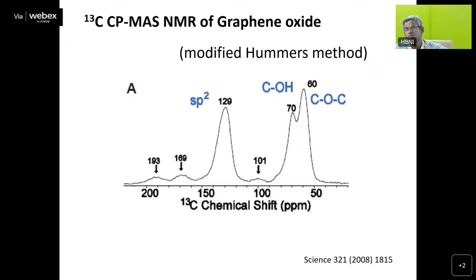Now let us give one more example of a 2D experiment, and with that I will move to something different. Just now I told you that dipole-dipole coupling can be generated with the help of a pulse sequence, and this pulse sequence helps to get cross peaks, from which you get information regarding the dipole coupling and the distance dependence of the structural units. So you can predict what type of structural unit is present. This is a very big gift in glasses. In glasses we cannot do neutron diffraction or any other technique; only this type of NMR technique can give us this information.